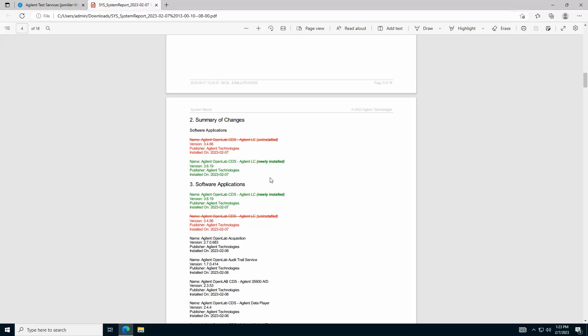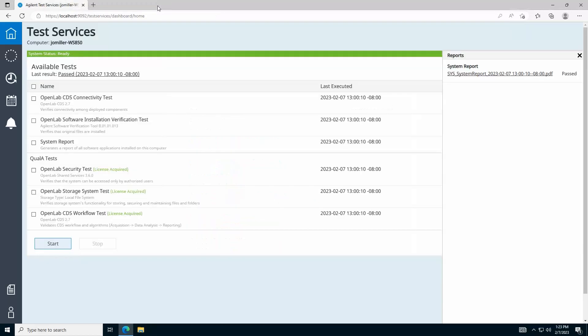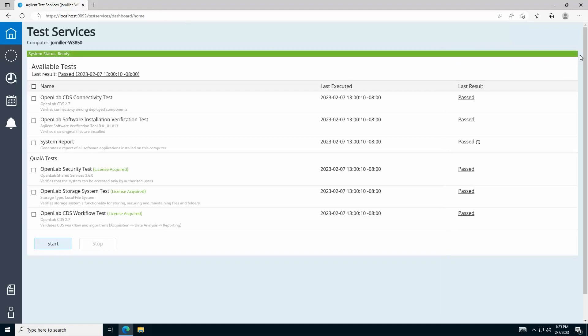This helps alert you to changes in installed software that may impact system operation. Each test performs a unique set of program tasks which test various aspects of the system environment related to healthy operation of your OpenLab CDS system. All selected tests must pass to establish a passing result overall.